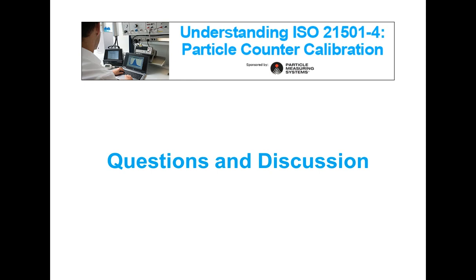This is because if you use a third-party calibration lab that is only verifying your instrument, but not adjusting, you may risk having an out-of-spec situation in a year or in 2 years. So it's always important to recenter the instrument performance, the sizing calibration, every time you calibrate the instrument.